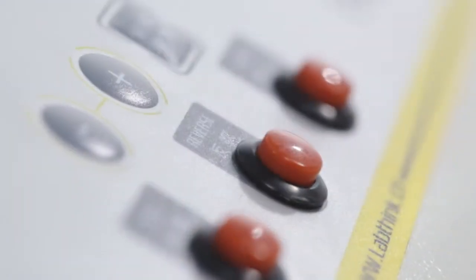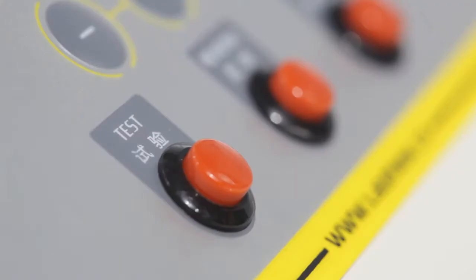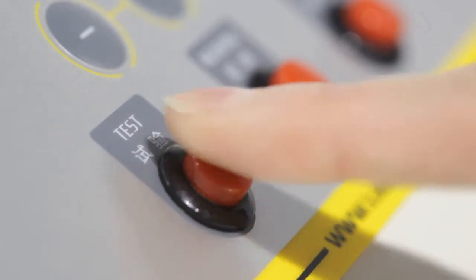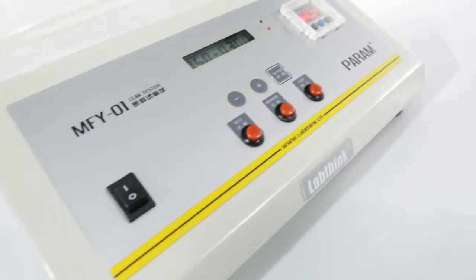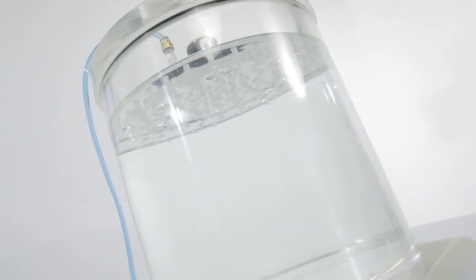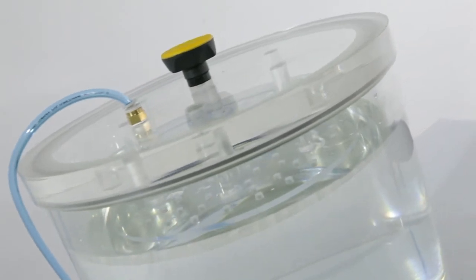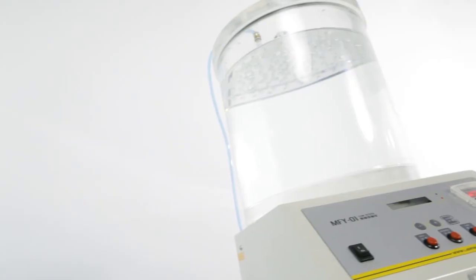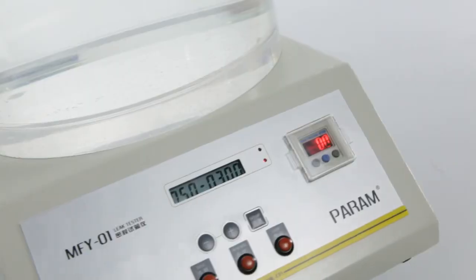This entire process is monitored and controlled by high precision manometer and microcomputer. The instrument allows presetting of vacuum degree and vacuum retention time. Test termination and air back flush functions make the entire testing process totally automatic and reliable.